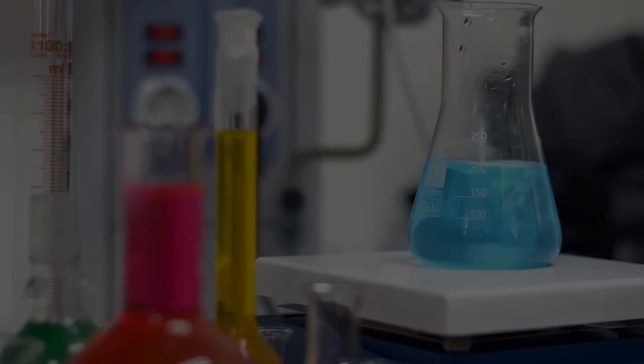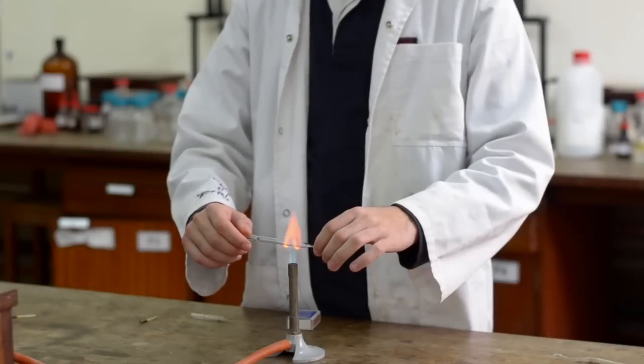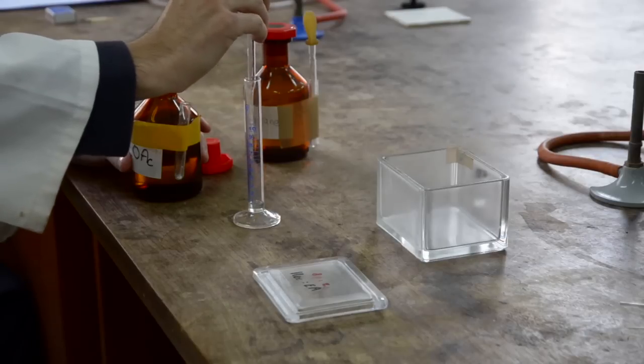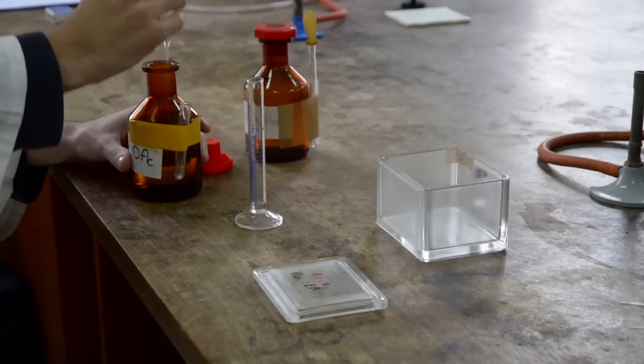Thin layer chromatography, or TLC, is an easy way to identify compounds and mixtures, as well as monitor the progress of reactions or chromatography.